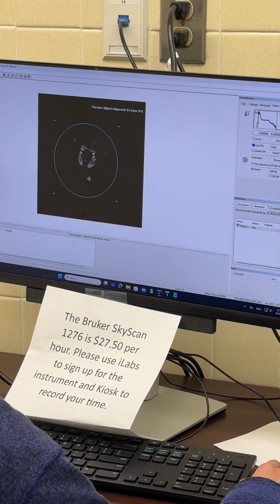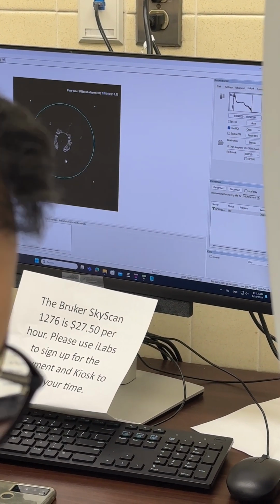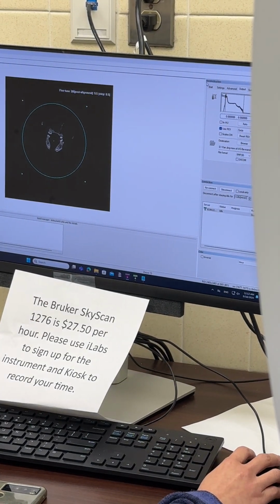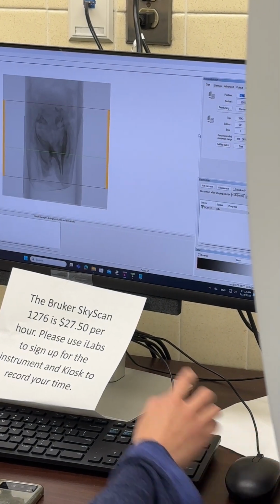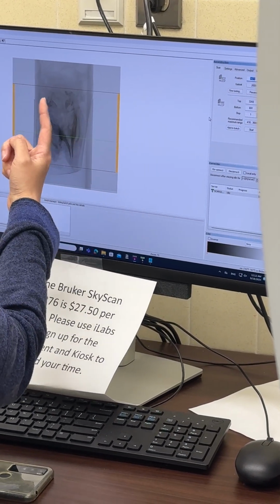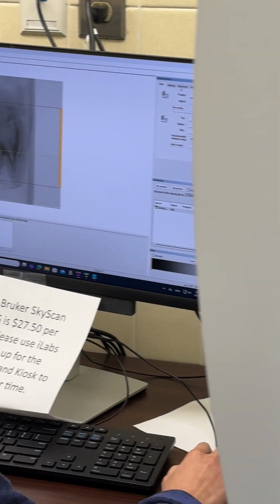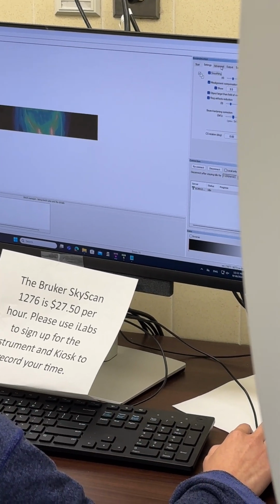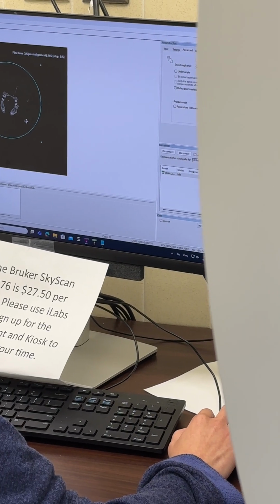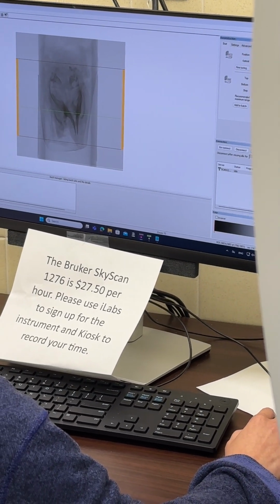Try to make it a little bigger, especially for our sample, when we were scanning, the mandible may be tilted a little bit. If we make the circle too small, let's go back to here. If it makes the circle too small, it may not include the complete area. So try to make it a little bigger. Where is it? Here. I guess here is pretty okay. Hopefully, yeah. And then here.